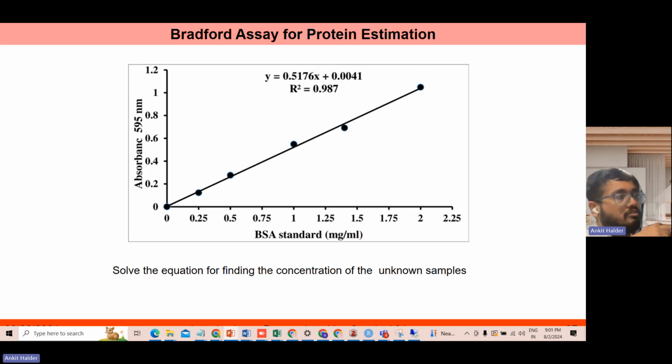So here, once we get the particular protein concentrations and we draw the standard curve, I will give you the hint how you will get the unknown concentration of the protein. For example, your unknown protein's absorbance lies here. Then you will go along the straight line to match with this trend line that you have drawn.